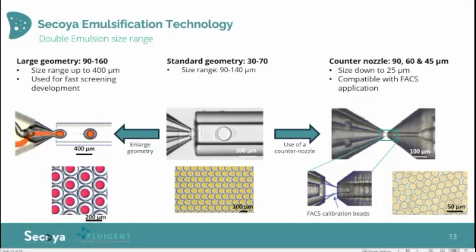But yes, I would add that this scaling up is a scaling up by parallelization. So the recipe, the process can be debugged using a single line system like this one, and then the recipe will be totally applicable in a larger scale equipment. That is the way we work. So the development that you can make with the single line system will be totally and directly applicable to the next equipment for large volume.